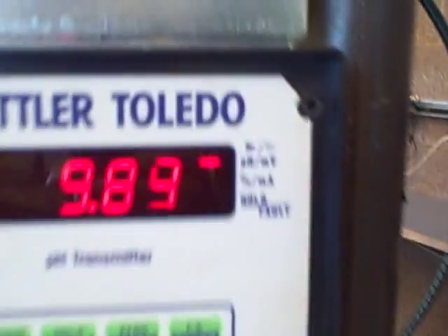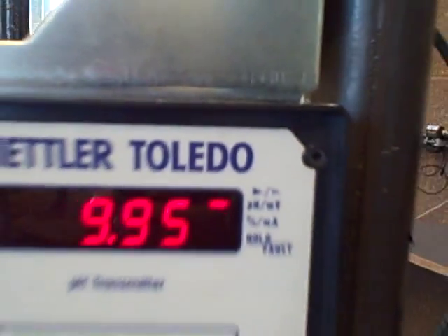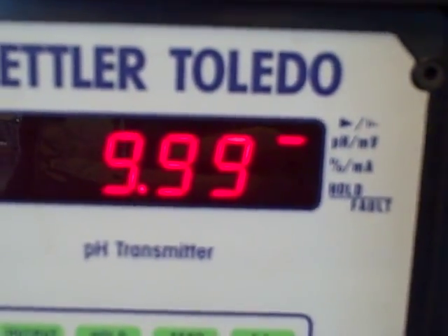I'll clean it off and put it back in the pH of 10. And it zooms up to 10. Wow. Unfortunately, I don't have any other pH solutions to test of any known concentrations. Great job, Jake.